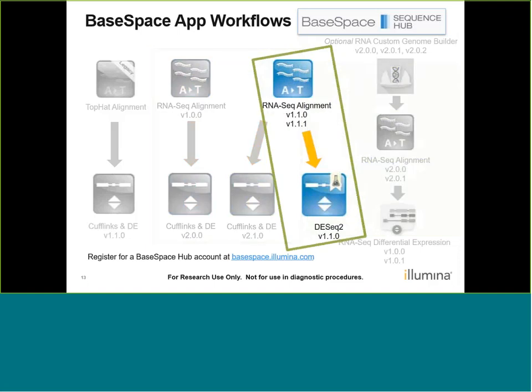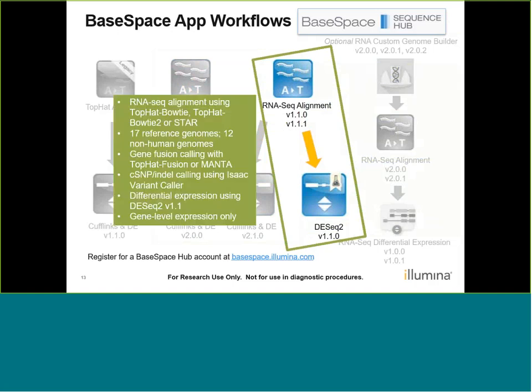An alternative to the other workflow is to feed your RNA-Seq Alignment version 1.1.1 output into the DE-Seq2 app. Now, the DE-Seq2 app is a BaseSpace lab app. So what that means is that this app is one of our as-is apps, and support is a bit limited. However, of course, if you come with questions, we will do our best to address them.